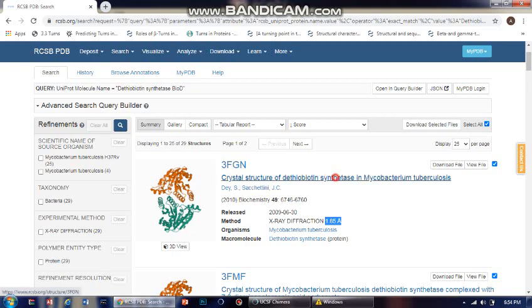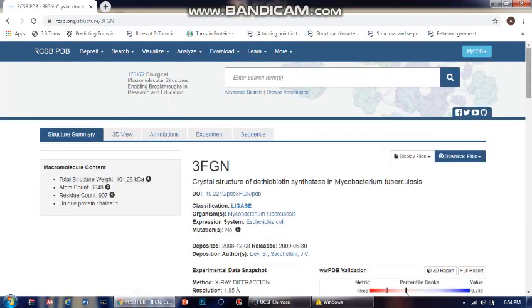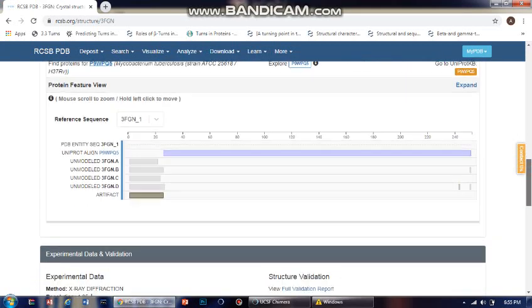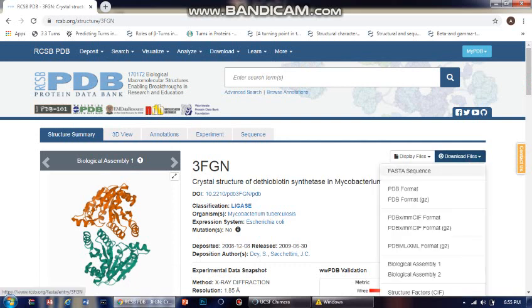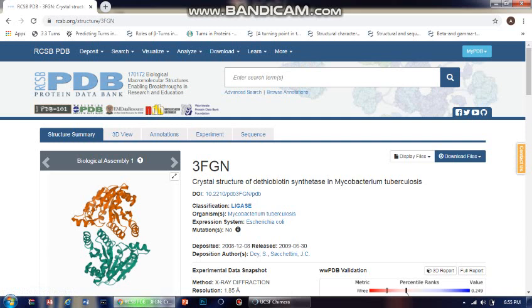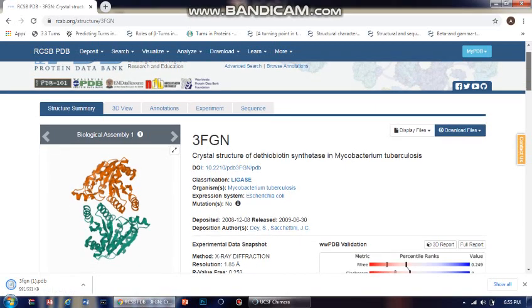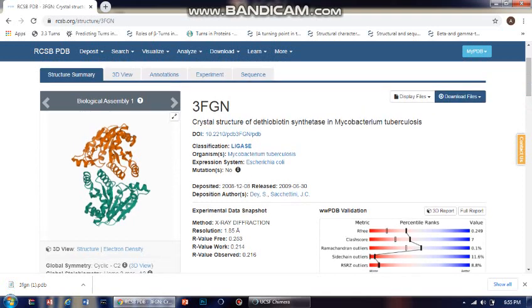Keeping it simple for the basics, clicking on this ID gives you a detailed information web page for that protein. To download the files, you can download the FASTA sequence file or the PDB format file. I need the PDB format file to visualize it in UCSF Chimera, so I'm going with that.